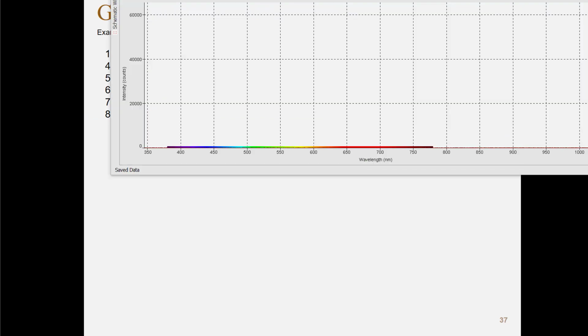Okay, so here we have the window from the spectrometer. Down here it's not so easy to see, but here it says 400, 450, 500, and so I'm up to 800 nanometers up here. And it's also color coded. I mean, this is false color coded by the program. And the higher the light we have, the higher it will go here. So let me start off by looking at a red LED. So let me see if I can find it here.